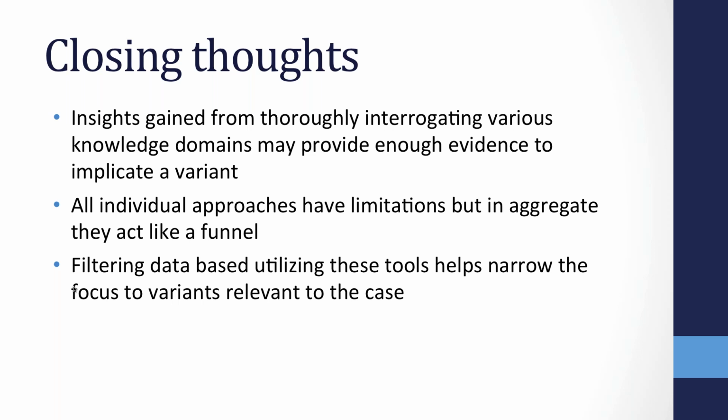There are a lot of limitations individually, but ultimately, the sum of them, or the aggregate of them, really do act like a funnel, and they distill those thousands, tens of thousands of variants into something that's clinically meaningful. And so ultimately, utilizing these tools is a very big help in narrowing the focus to those variants that are relevant to this case in particular.